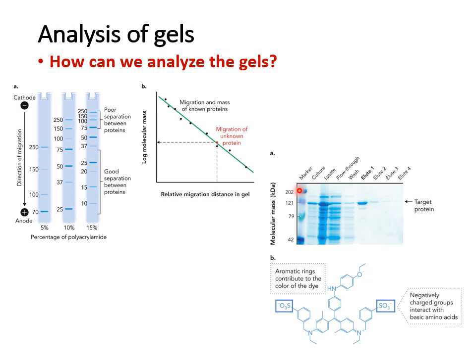And it's important that they're known because it means that you know the exact sizes of the bands that will appear. So the bands are the lines. The exact sizes of each of those bands you know because that is a sample with known fragments of protein. And that's very important for you to then use to compare to any of your sample lanes.